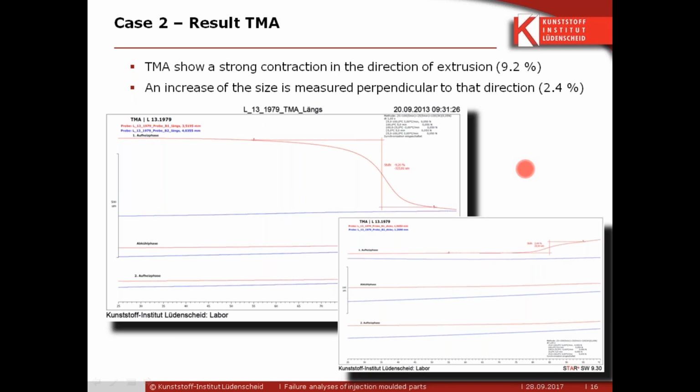In this case, I don't think that annealing is enough. If we only have 1 or 2% annealing, would that be a good idea? Yeah, I think so. Actually, annealing would only remove the failure right away, let's say. However, it wouldn't address the root cause. But annealing commonly helps.